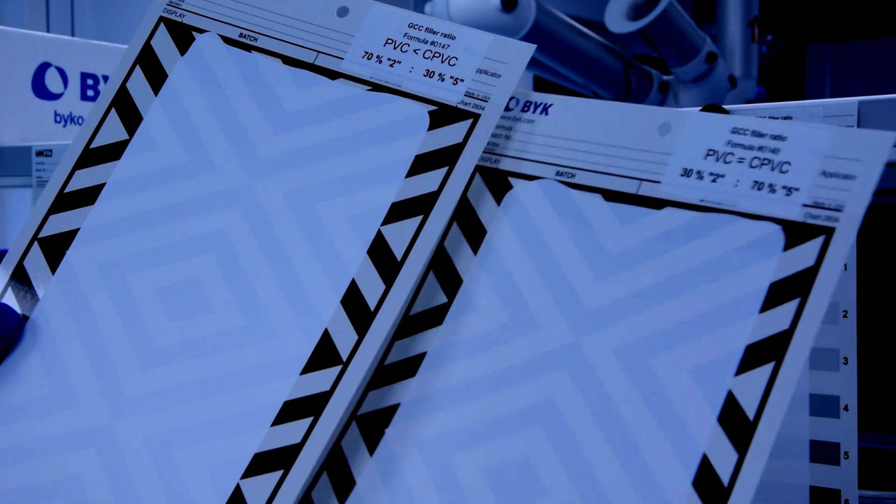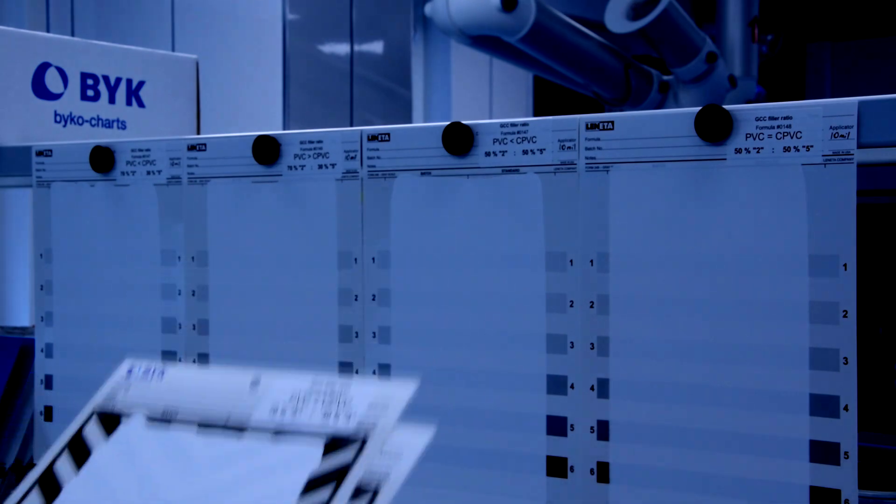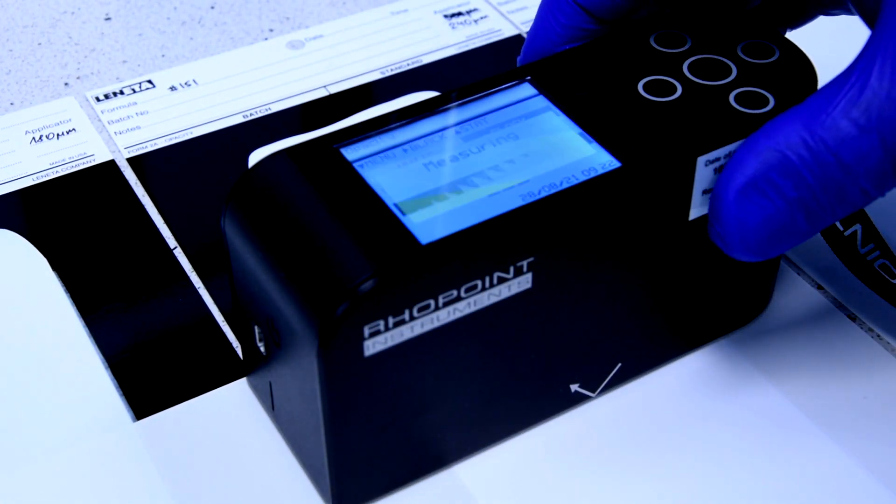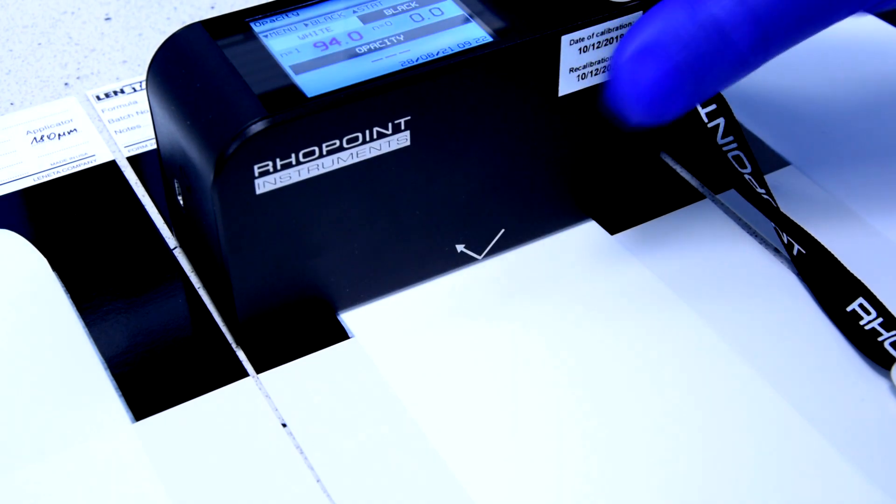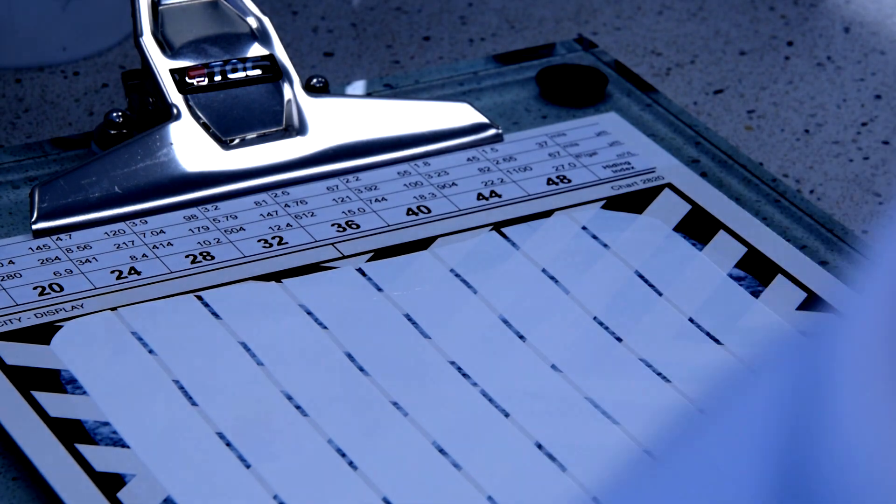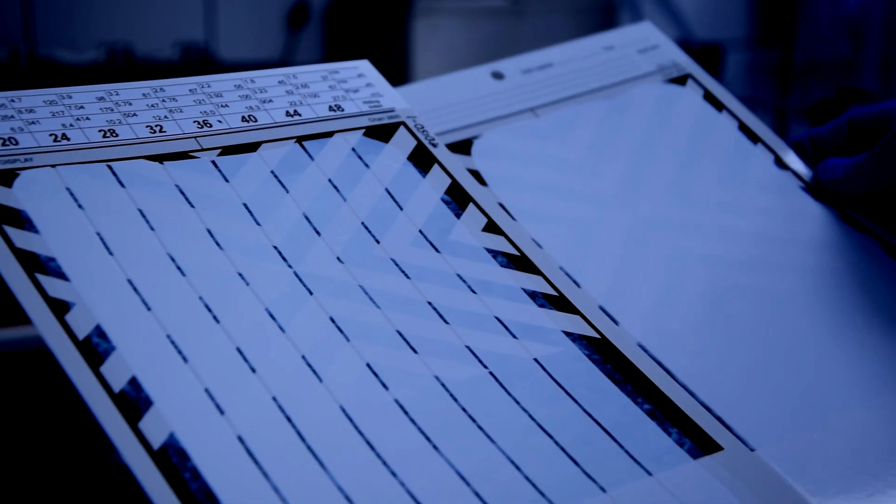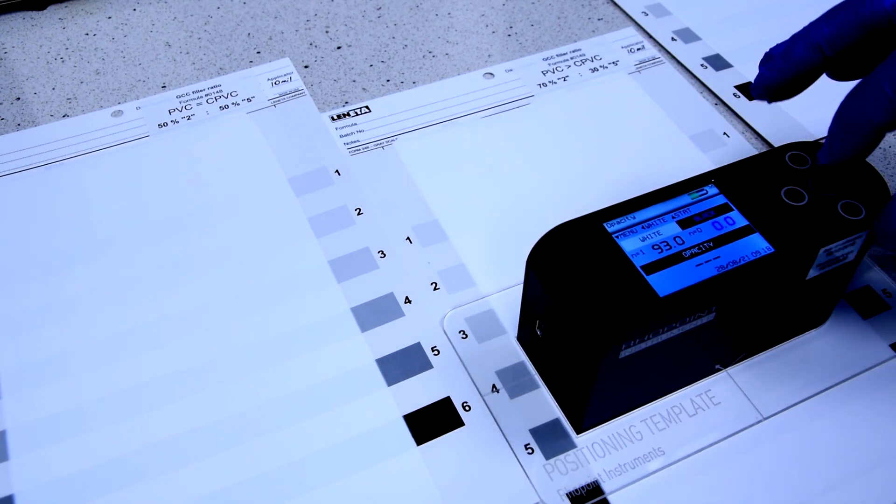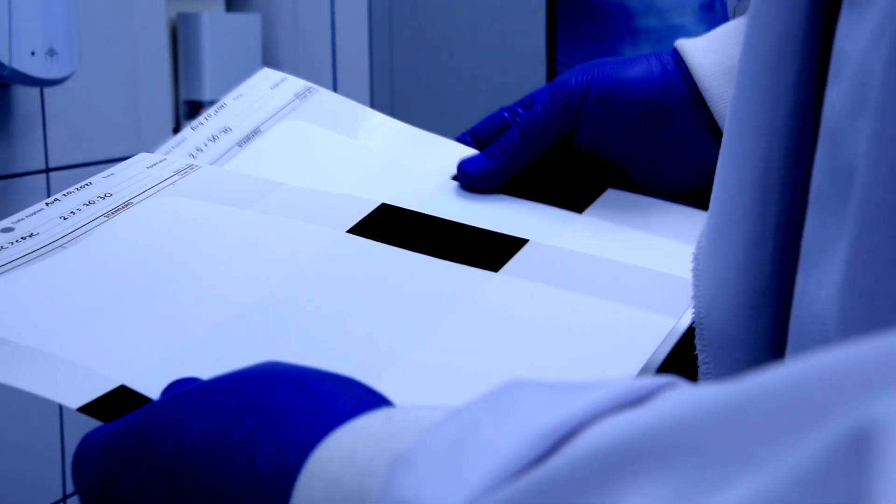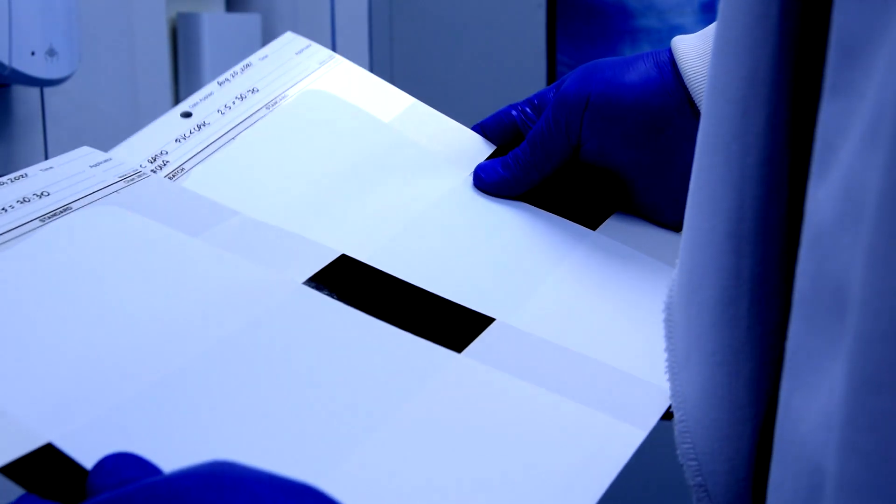In our lab, we check the effect of raw materials on hiding power and opacity using various test methods, from reflectometric determination of hiding power at a specific spreading rate in accordance with ISO and ASTM, to wet-to-dry opacity change test, hiding power when applying with a brush and roller on substrates with varying degrees of contrast and differential absorbency, to determine the effect of penetration on the properties of primers.